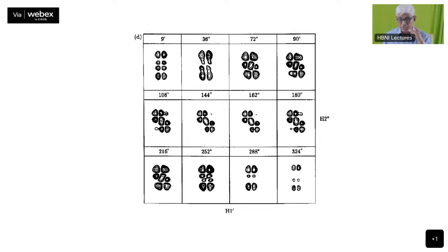And this is for the 1' to 2'' peaks, where the resolution is much better because the coupling constant is quite more suitable. And the 2'' 3' peak has a smaller coupling constant, and therefore that doesn't show up as much. Whereas the 2', 3' shows up always. And therefore the fine structure is much clearer here because of the fewer coupling constants. And you see this peak has a very different structure here. This is a C3' endo, a very different structure compared to the C2' endo sugar geometry here.